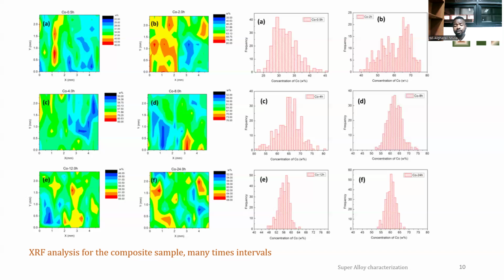It started in a well mixing way, and after that, it moved sequentially until it reached 24 hours. It distributed the couple in a very good homogeneous way. So time is considered crucial in terms of mechanical mixing, as more time given to the mechanical mixing or to the mill, it will give a more uniform composite.